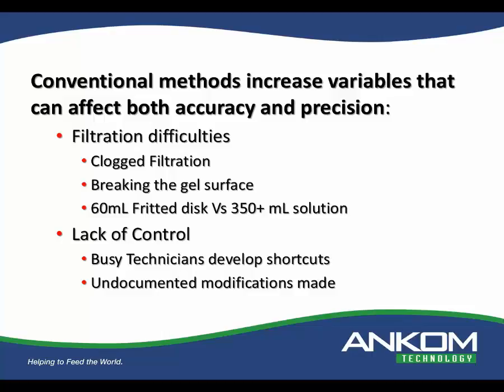perhaps they were looking at the Codex method, and the Codex method does have a step where between one enzyme and another they do a deactivation by taking the temperature to 100 degrees for 20 minutes. So I'm guessing that a technician had done the Codex method and then just applied it to 991.43. Again, it's not what the method calls for and can have an impact on the results, especially if some are doing that and some are not.